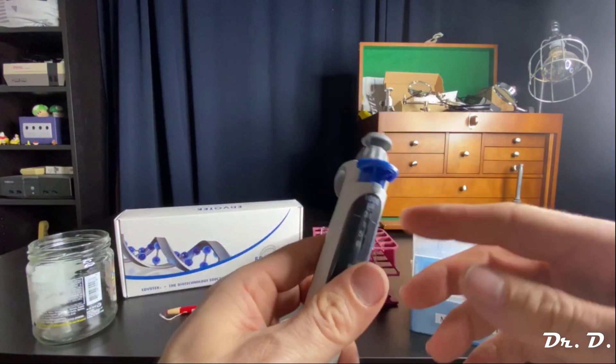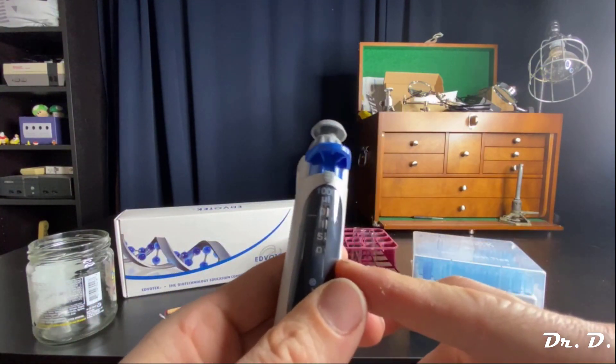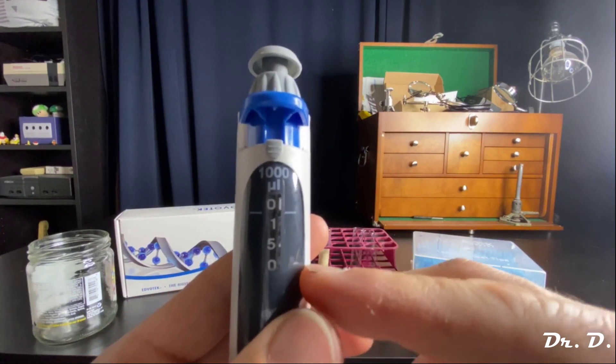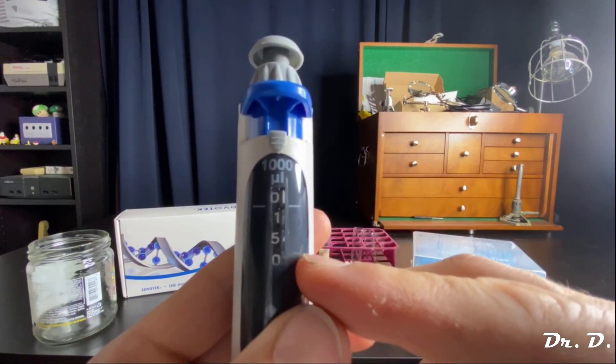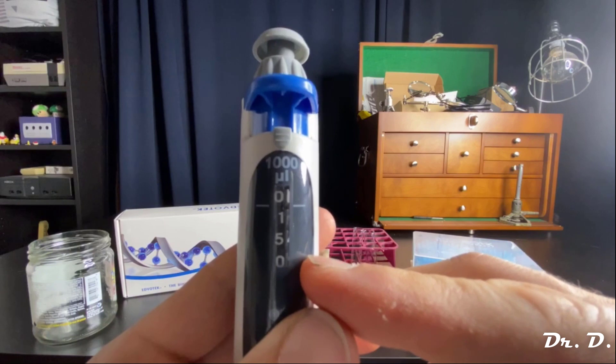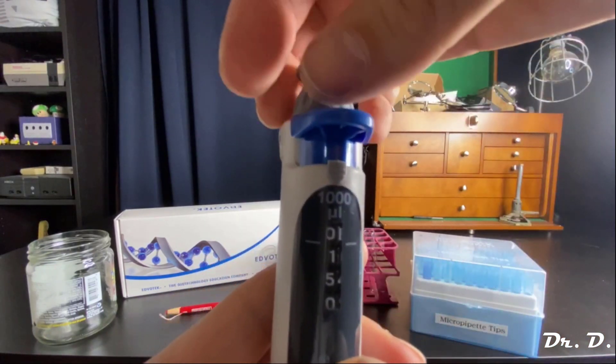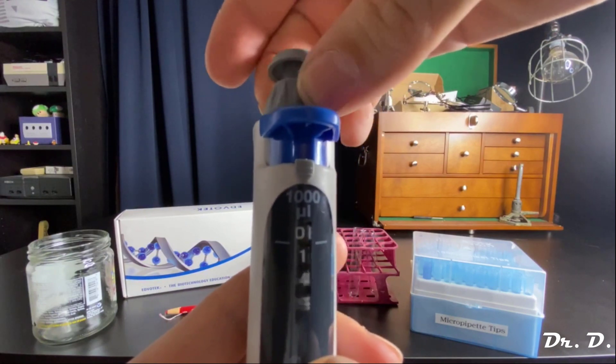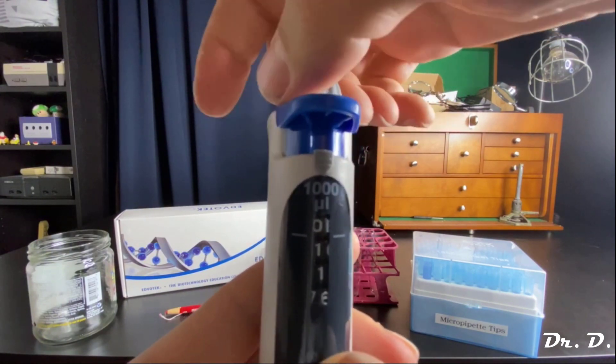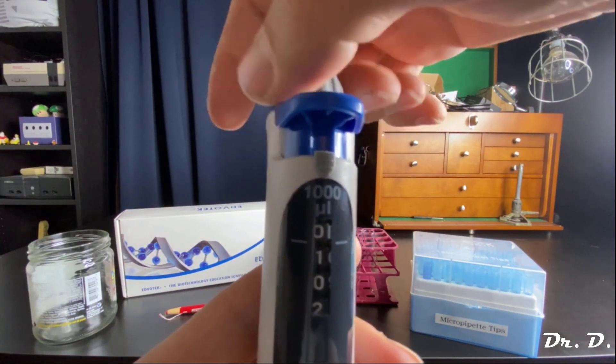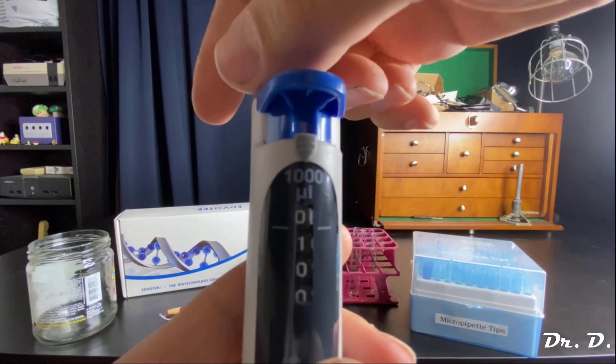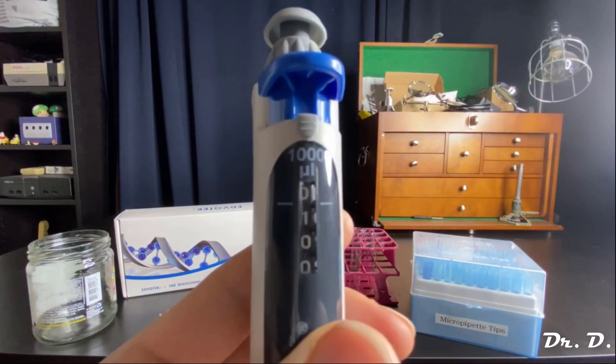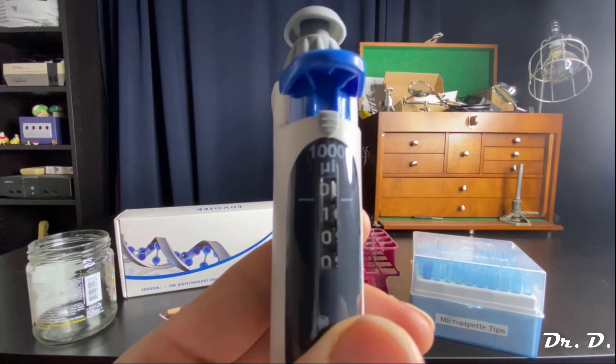To set it, you have to look at the dial on the side. This is the dial that indicates the volume setting of this particular micropipettor. The lowest setting, if we turn this gray dial at the top, would be 0, 1, 0, 0, which means 100 microliters.